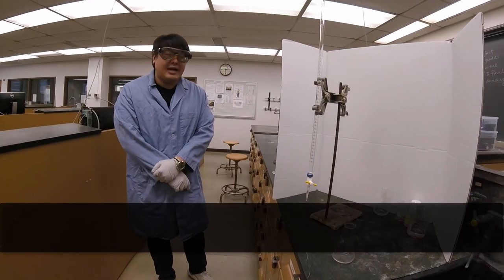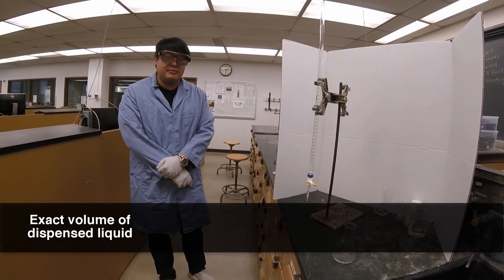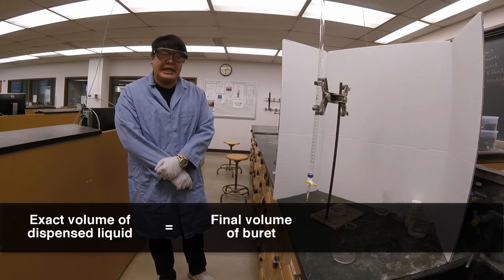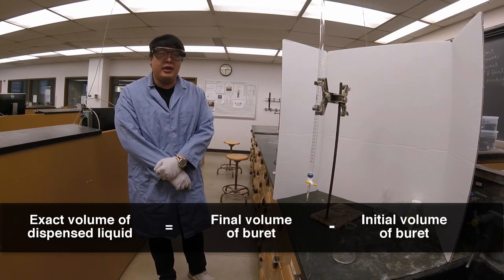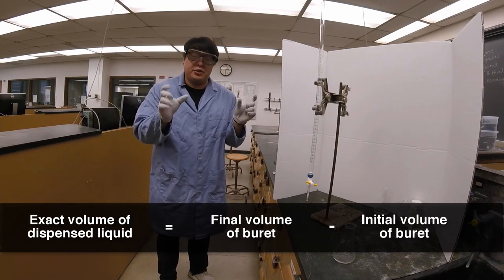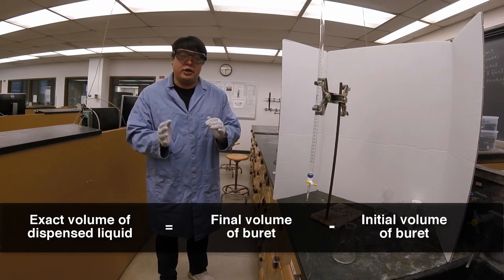To calculate the exact volume of the liquid dispensed from the buret, you want to take the final volume minus the initial volume. And that is why it's really important you get the initial volume and the final ones, because you need to do the difference to actually find the volume dispensed.